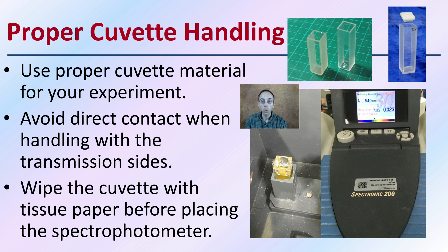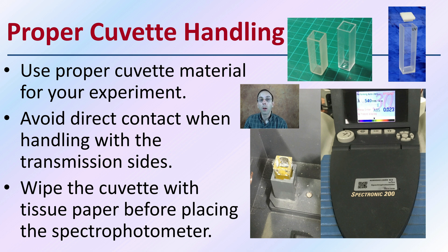The clear sides are where the light will be projecting through, so we want to avoid contact with those. We want to be sure that before placing the cuvette into the machine, we're wiping it with tissue paper to ensure there's nothing on the outside that would conflict with getting an accurate reading of our sample.